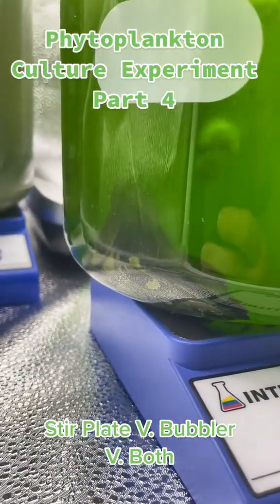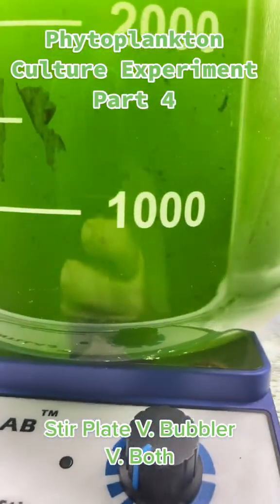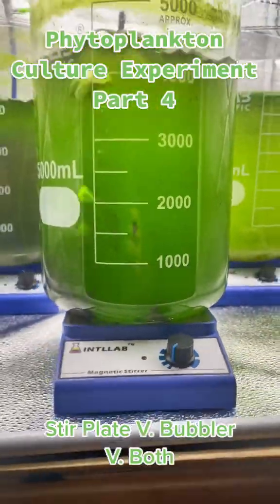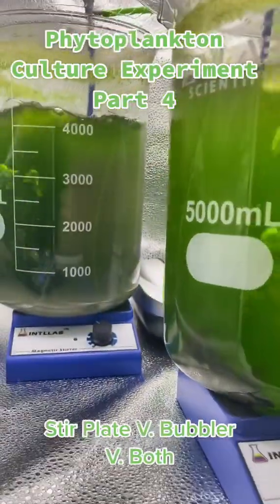You can see I'm getting some odd algae growth on the bubbler one. I've never had that before. I'm not exactly sure why that's happening, but it is happening.